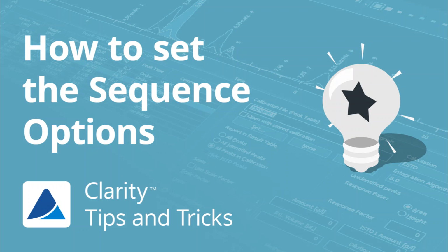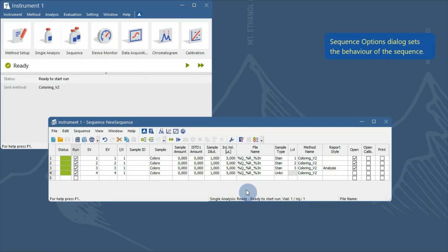Hello, in this video, I will show you how to set the sequence options in Clarity. These settings influence how the sequence table and the sequence itself behave, and are specific for the open sequence file. To display the sequence options dialog, go to the sequence window, and select the options icon in the toolbar, or the options item in the sequence menu.